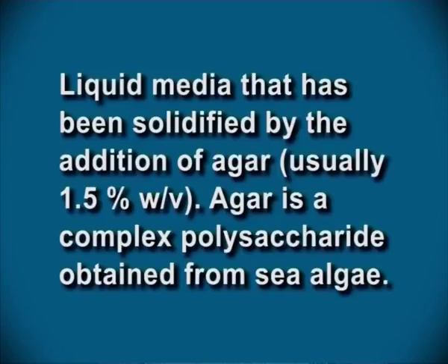Solid medium. Liquid media that has been solidified by the addition of agar, usually 1.5% weight by volume. Agar is a complex polysaccharide obtained from sea algae. The solid media can be placed in petri dishes, that is agar plates, or test tubes with a large surface area, or agar slants.